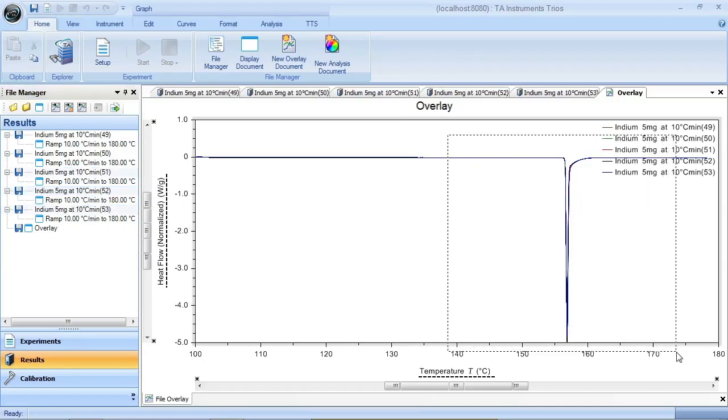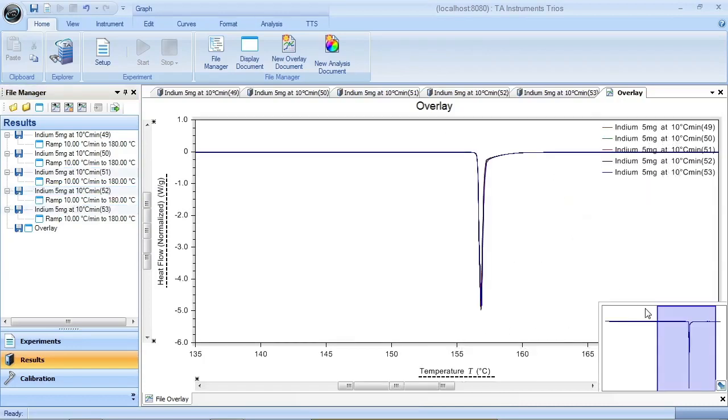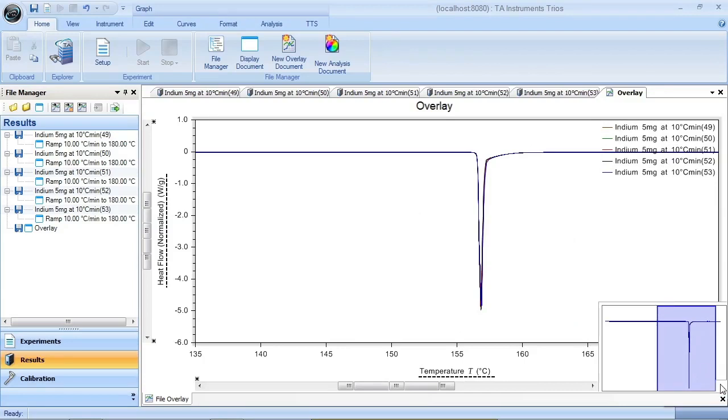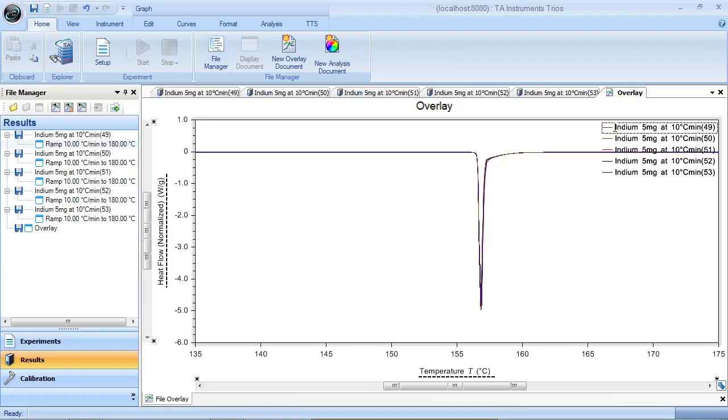If you just want to rescale it a little bit with a zoom box, this will show you how you've zoomed in. You can close that down by clicking right there. So now I have my plot. I have my legend here. It shows the multiple curves. You can select the curve by selecting the legend itself.